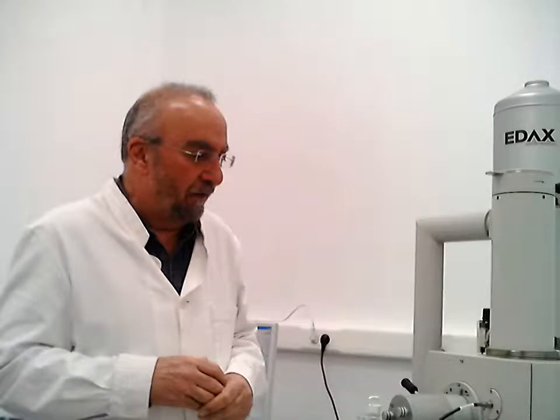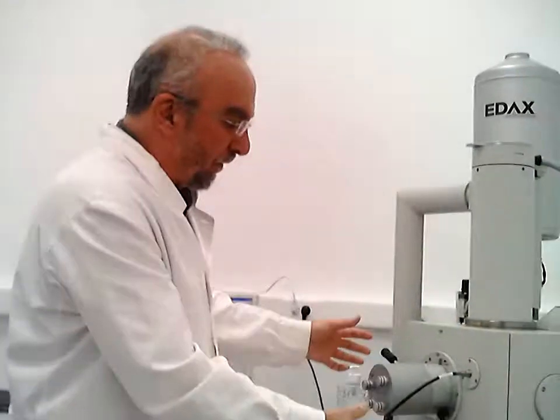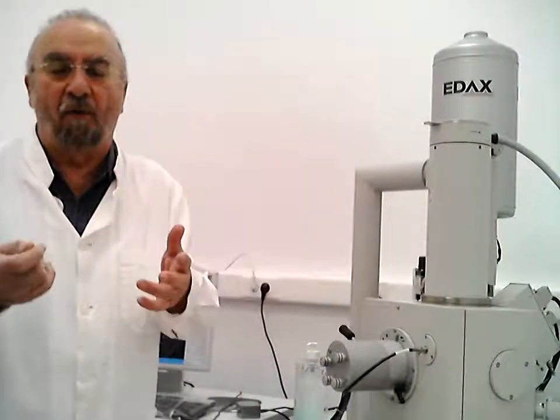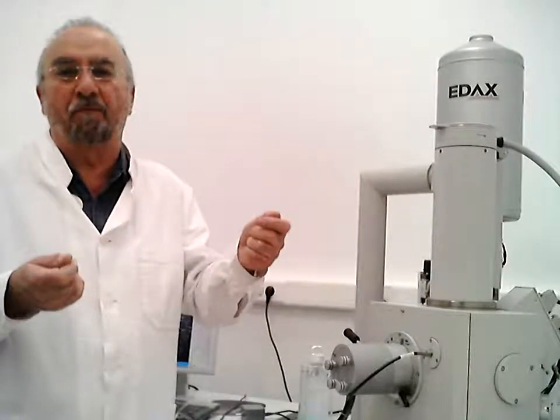A forensic scientist will go around the place where the crime took place, and start collecting tiny evidence like hairs, tiny pieces of blood, for example, pieces of soil or material from the ground, whatever they can find. And then one of the first things they do is bring it to the electron microscope, which is this. This is a chamber which has been evacuated, because electrons are so small and so sensitive that they must be protected from hitting the atoms and the molecules in the air.